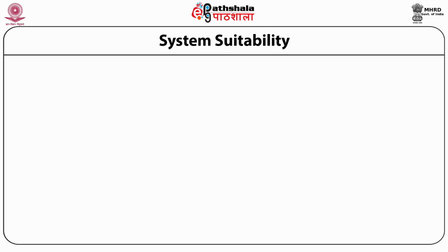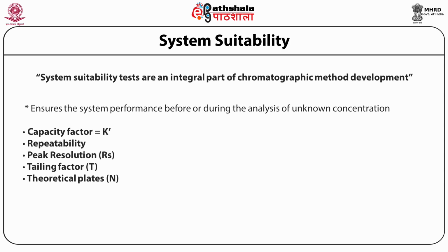Before we go for complete validation, the first thing we need to look at is system suitability. System suitability tests are an integral part of chromatographic method development. Some of these factors I have already explained to you, but these tests are very important to understand, to know that the method you have developed is fit to carry forward for method validation.